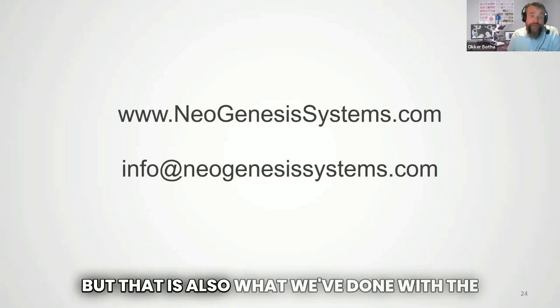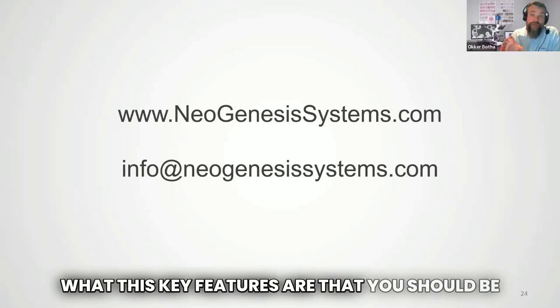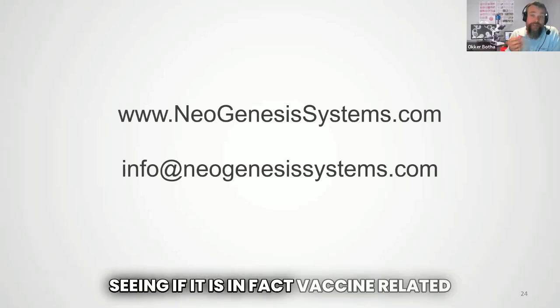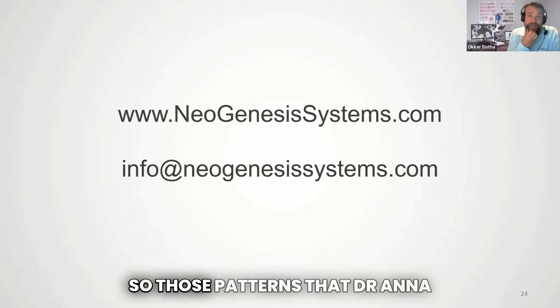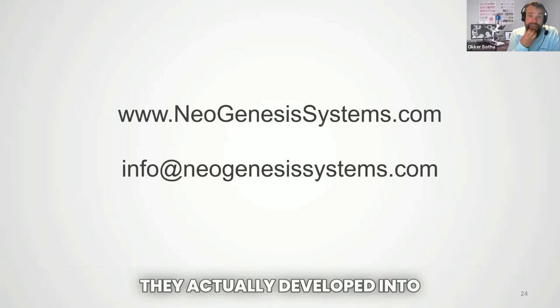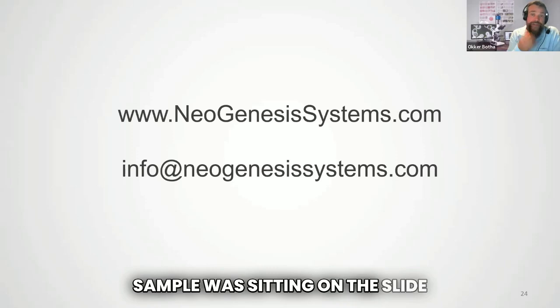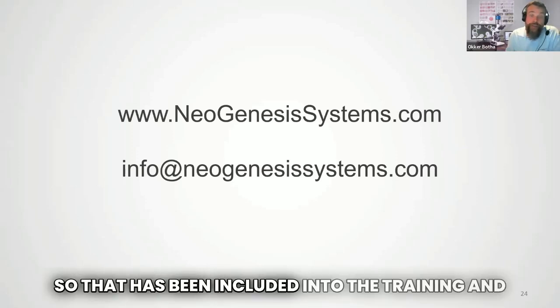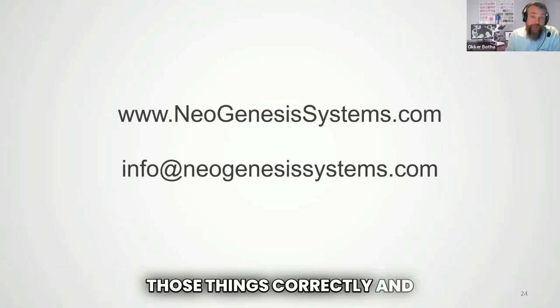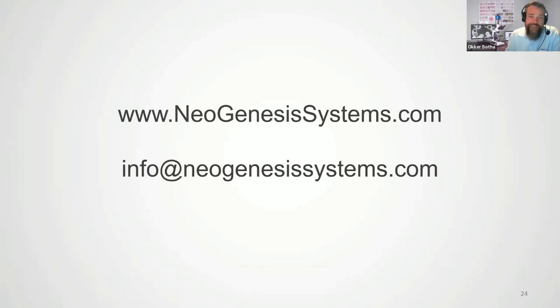That is what we've addressed in the latest module: defining very clearly the key features you should be seeing if it is in fact vaccine related. The patterns that Dr. Anna identified were not just static. They actually developed into specific things while the sample was sitting on the slide. That has been included in the training, to allow people to identify those things correctly and not get alarmed about things that are just artifacts.